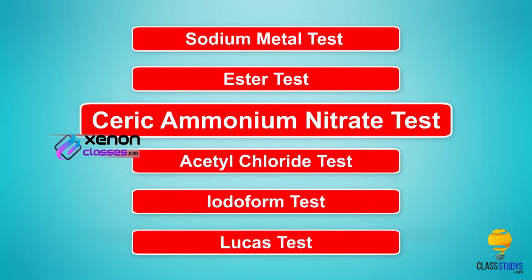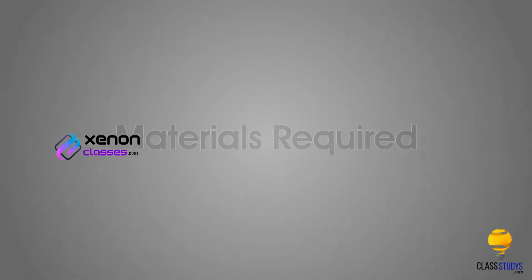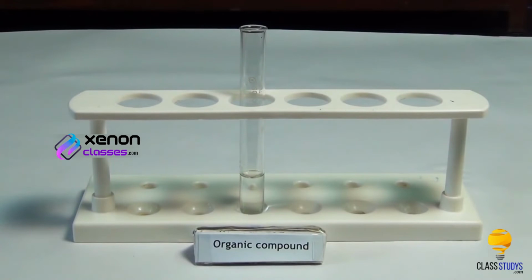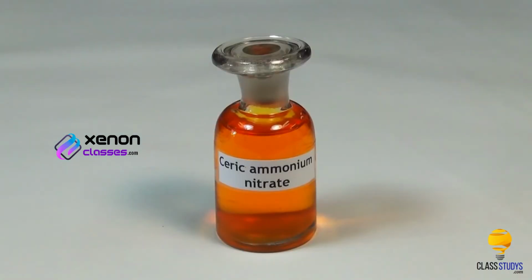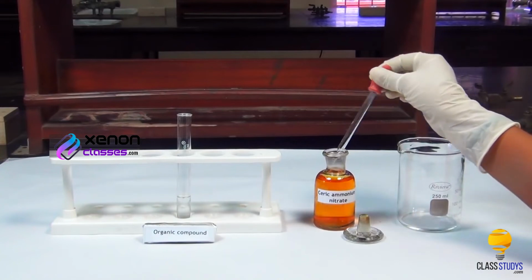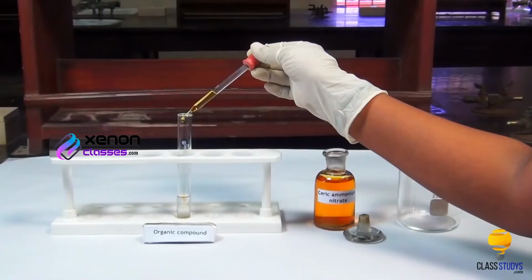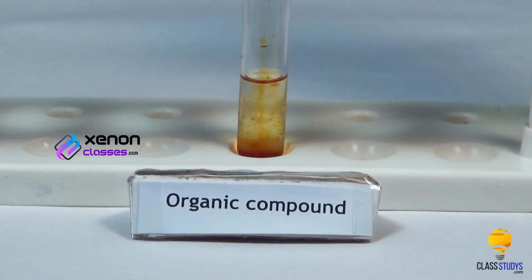Ceric ammonium nitrate test. Materials required: organic compound, ceric ammonium nitrate reagent, test tube and a dropper. Procedure: take a small quantity of ceric ammonium nitrate reagent using a dropper. Add it into the test tube containing a small quantity of organic compound.